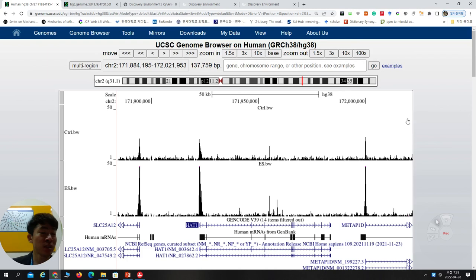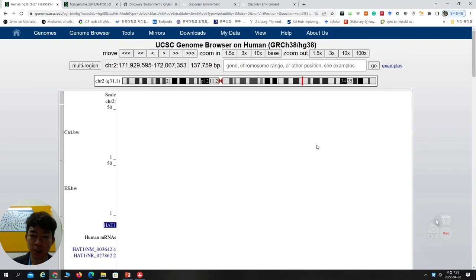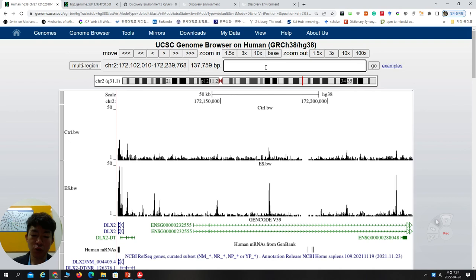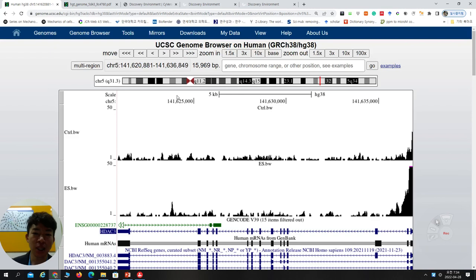This is way better. As you know, this HAT gene is from chromosome 2. You can also Ctrl+scroll to zoom and shift as much as you want. You can have some journey exploring which genes are there. If you want to go to, say, HDAC3, you can type it and go. HDAC3 is located in a certain chromosome, on both sides. This is a scale bar in the chromosome showing where they are located from the beginning.